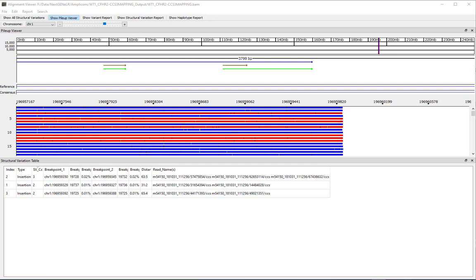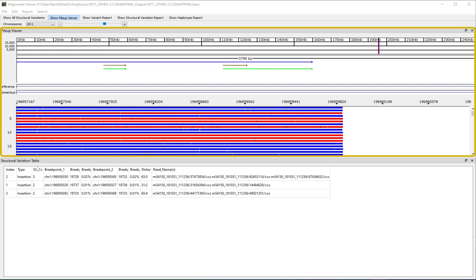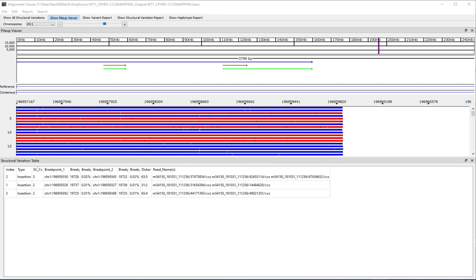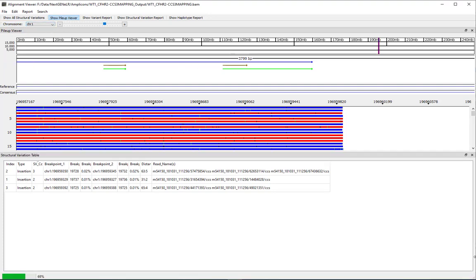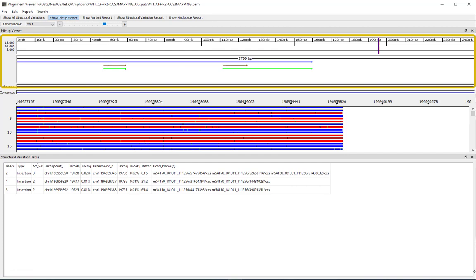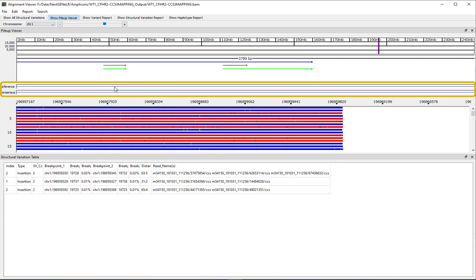When the results are initially displayed in the NextGene Elahar alignment viewer, the pileup viewer and structural variation table are the default view. The pileup viewer is the upper portion of the viewer. One chromosome is displayed at a time. If the reference contains more than one chromosome, the chromosome for display can be selected from the drop-down menu at the top left. The top of the pileup viewer shows the reference positions with the reference annotations directly below. Blue arrows represent gene regions, green arrows represent mRNA regions, and brown arrows represent coding regions. In the middle of the pileup viewer, reference and consensus sequences are shown. Zoom in to view the nucleotides in these panes.